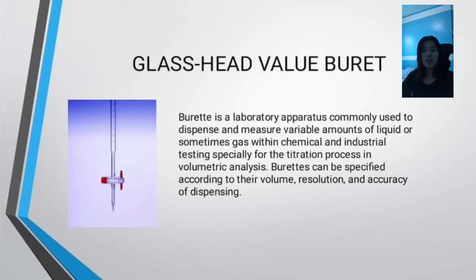The glass stopcock burette. A burette is a laboratory apparatus commonly used to dispense and measure variable amounts of liquid or sometimes gas within chemical industrial testing, especially for the titration process in a volumetric analysis. Burettes can be specified according to their volume, resolution, and accuracy of dispensing.